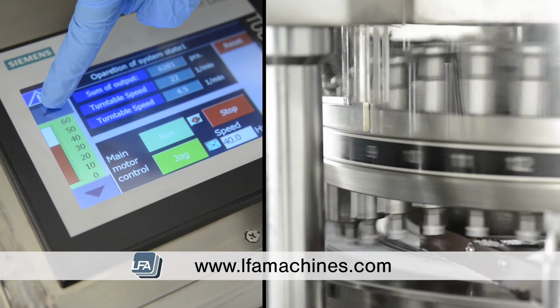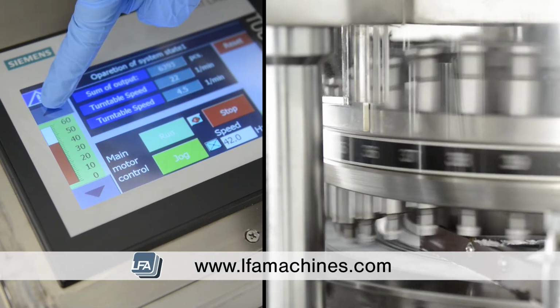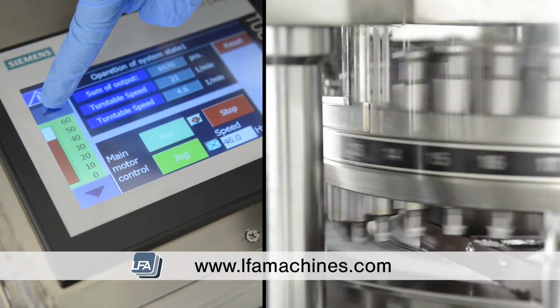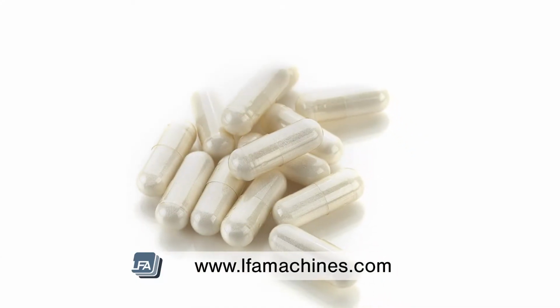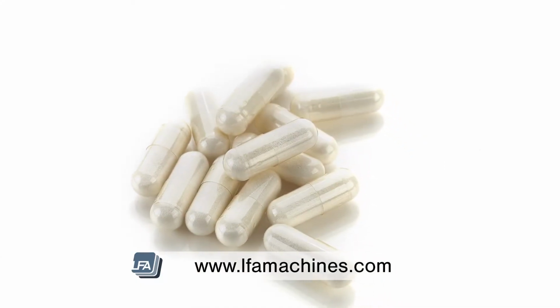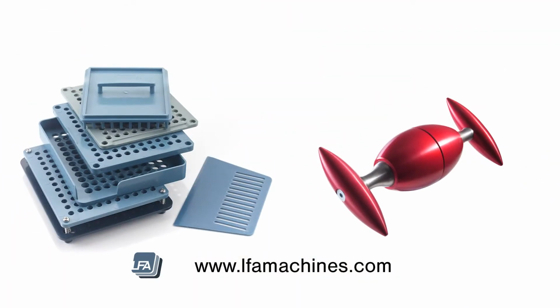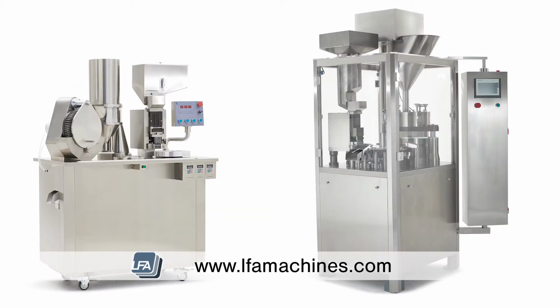Tablets are cheaper to produce due to the manufacturing process. Tablet presses run faster, reducing production times and costs on big batches. On top of this, the manufacturer doesn't need to buy a two-piece hard-shell capsule. Both tablet presses and capsule fillers are easily accessible and can be made on a desktop or handheld machines. If, however, you're mass producing capsules, the larger capsule fillers are generally more expensive.